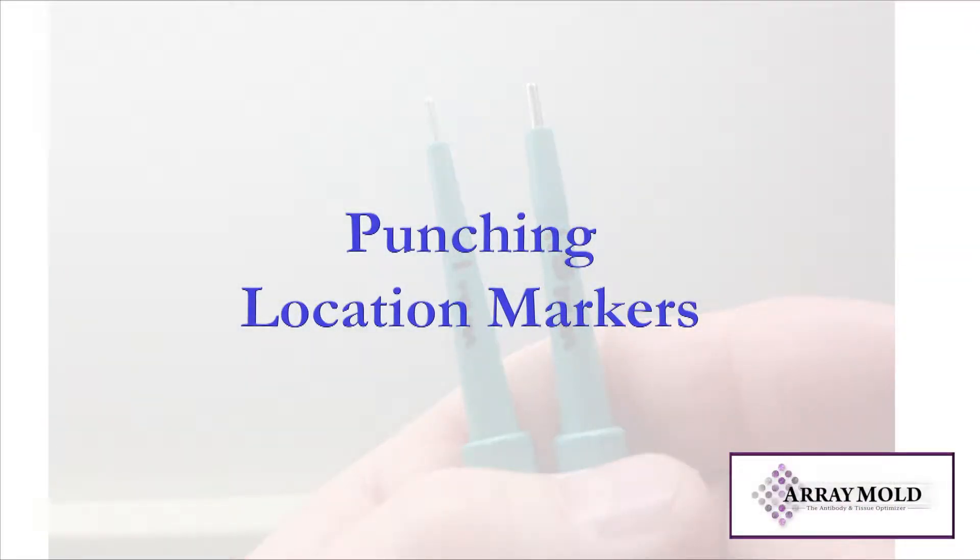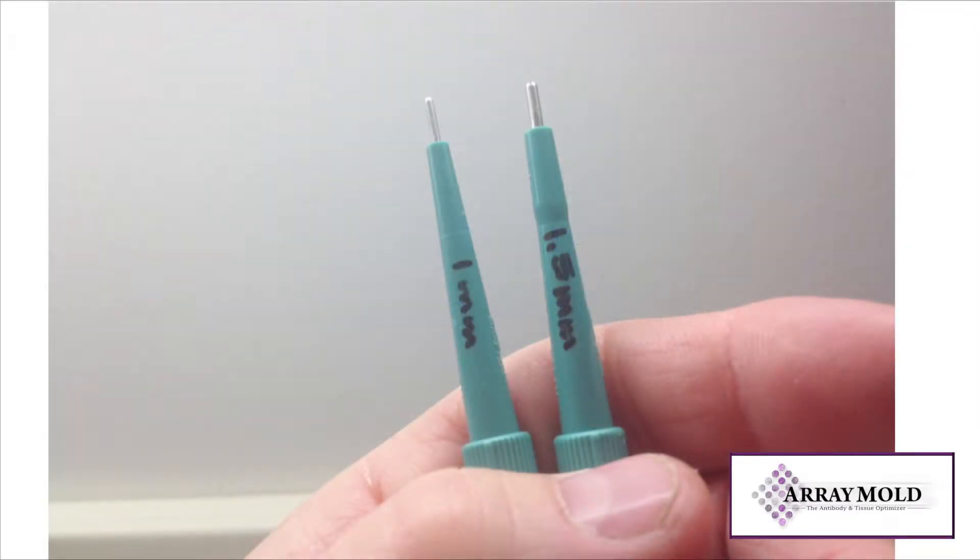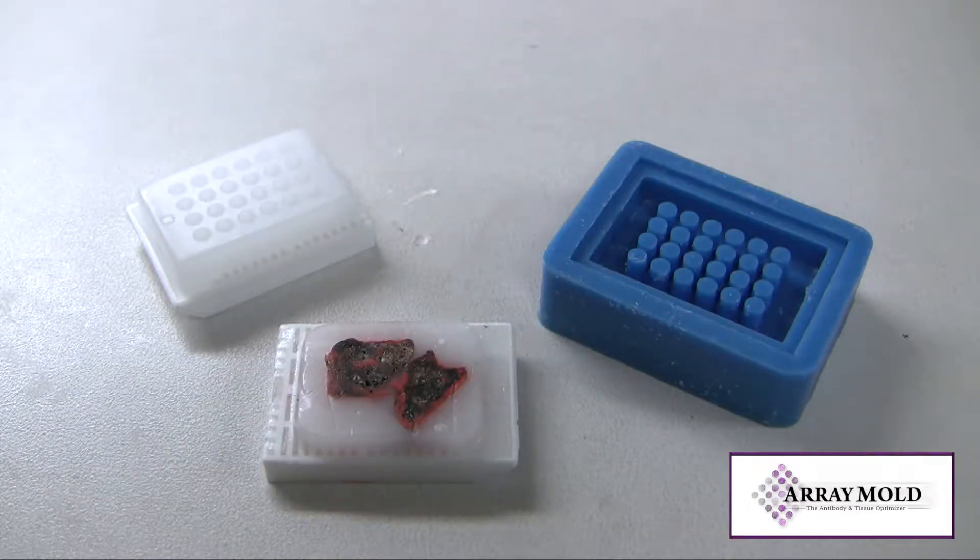Always punch the location marker first before you add any tissue to your tissue microarray, just in case you crack the block.